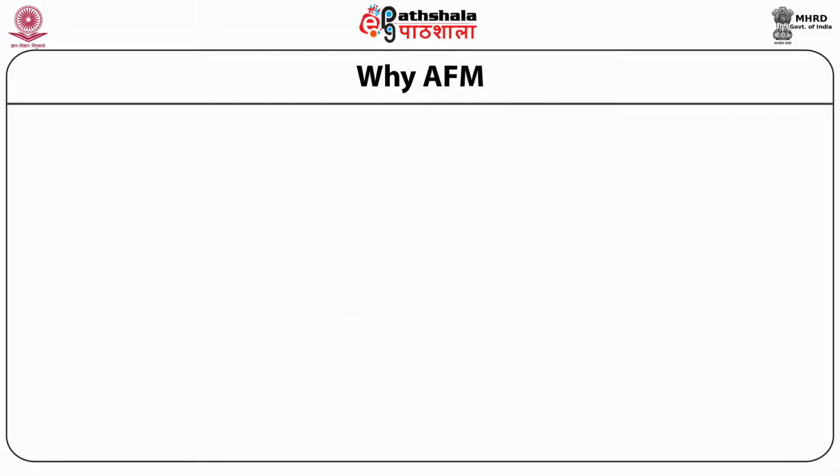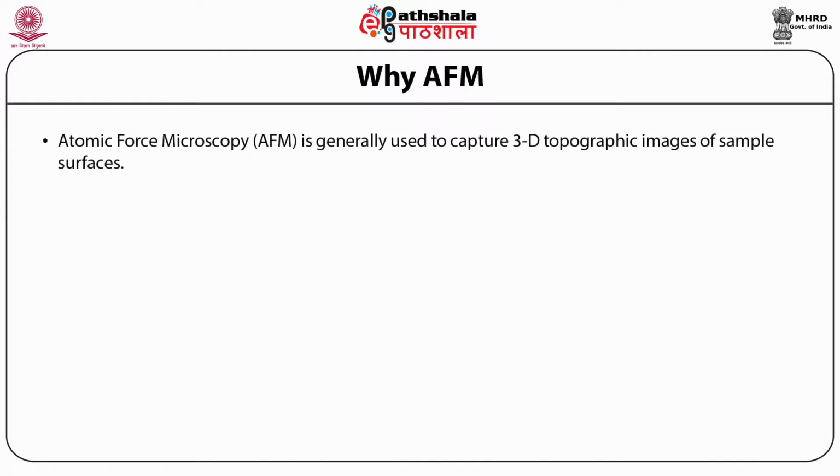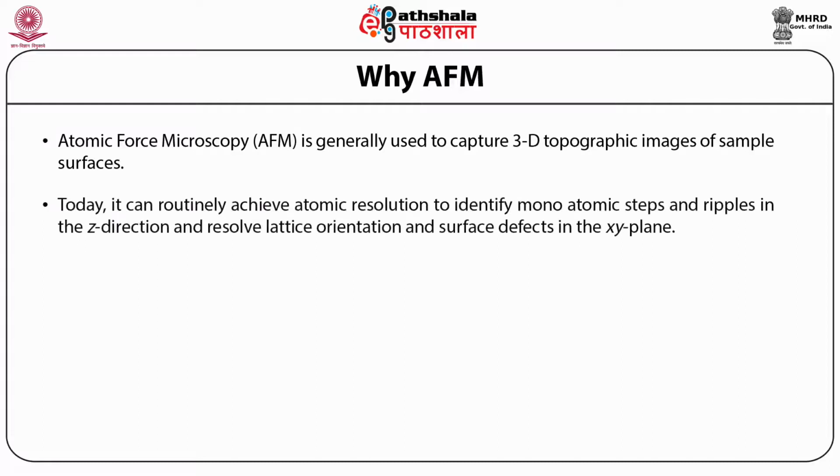Why will AFM be used? Atomic force microscopy is generally used to capture 3D topographic images of sample surfaces. Today it can routinely achieve atomic resolution to identify monoatomic steps and ripples in the z direction and resolve lattice orientation and surface defects in the xy plane.